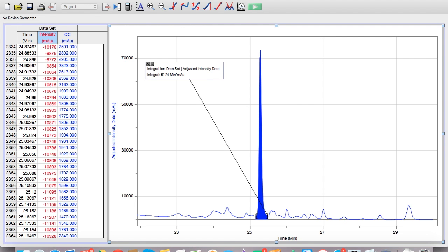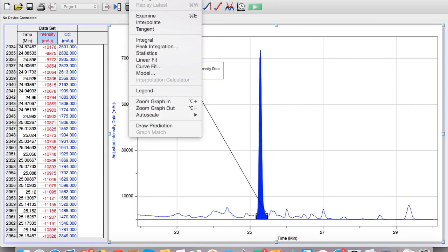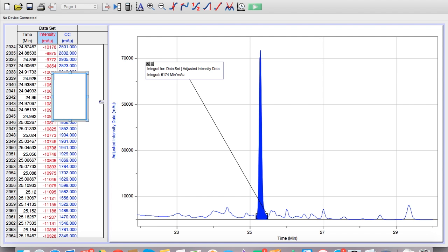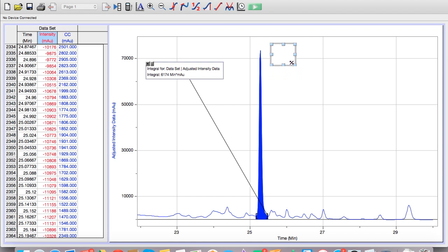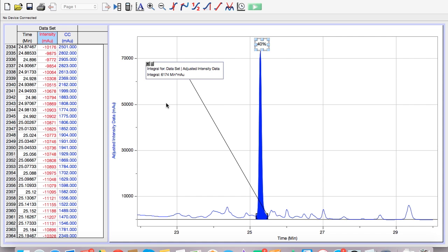What I like to do is I go here, insert, text, drag this over here, and I'll say 40%. So now I know that this peak is 40% of my total area. So now we're going to go through and integrate all of the peaks and then put their percentage above each peak.